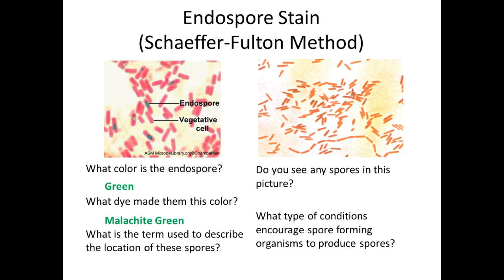So it'll be more like pictures like you had on your quiz today. But this is a really good picture. You can really see really well, right, the arrangement. So which one of the terms describes the arrangement of this spore within the cell? Subterminal. Do y'all see that? It's not smack in the middle, which would be what? Central. And it's not at the end, which would be terminal. This is in between the middle and the end, right? So it's subterminal.